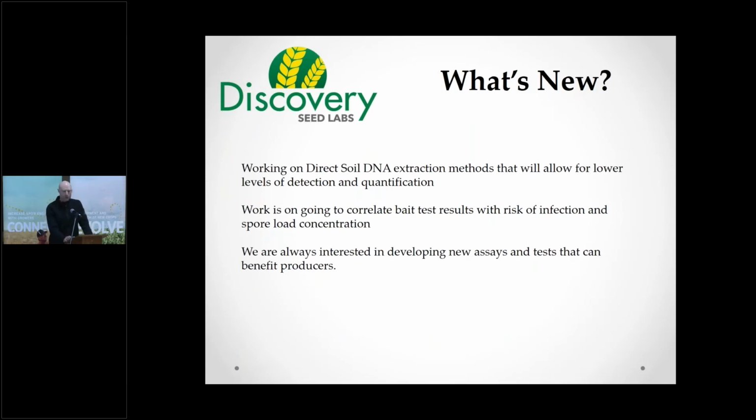And what we're working on now is a direct soil DNA extraction method that would allow us to better quantify the pathogen level in the soil. Everybody wants a number, a spore load, let's say. It's pretty tricky with Aphanomyces. It can exist in the soil at extremely low levels and still cause damage. The soil is a pretty complex medium to work with as far as getting all of the complete DNA out. So we're always working on getting a better soil DNA extraction method that will allow us to provide you a number.